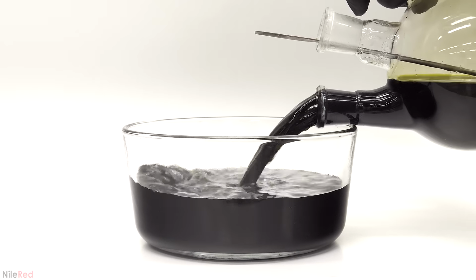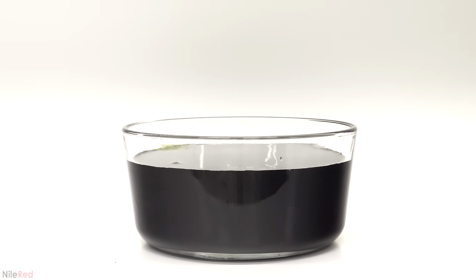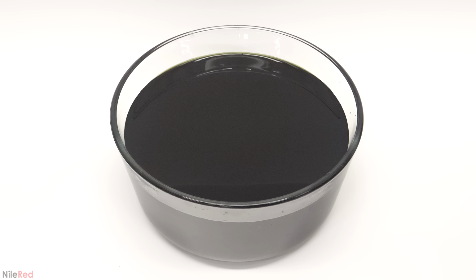I then poured it all into the same bowl, and there was almost nothing left in the flask. Just for good measure though, I quickly rinsed it with water, and I put the flask into the sulfite bath from earlier. At this point, I could have just poured all of this waste into a bottle and forgotten about it, but I don't really like storing it like this.